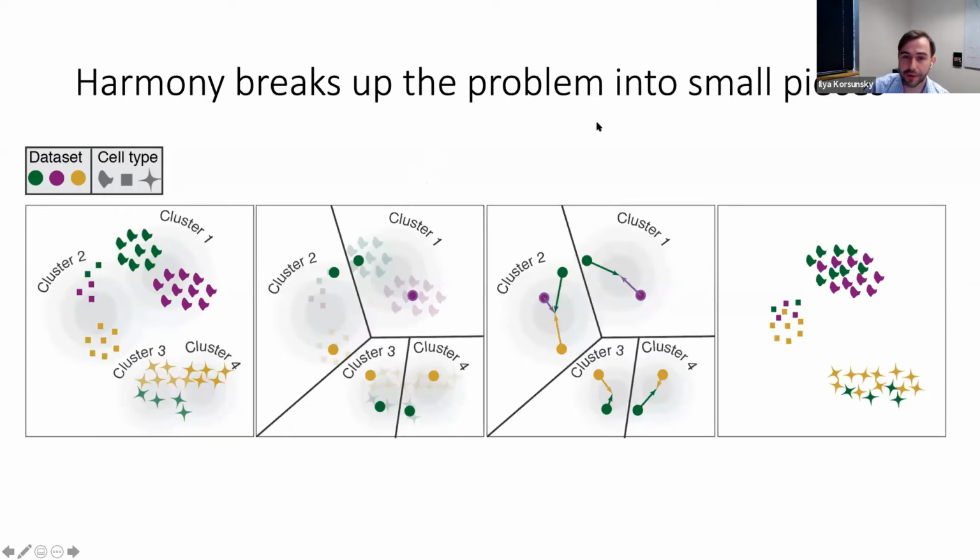Oh, so it looks like we have our first question. The question is: is there a way, besides plotting, to assess how successful my Harmony integration was? Will it affect the differentially expressed genes or improve my results? It's a very good question.